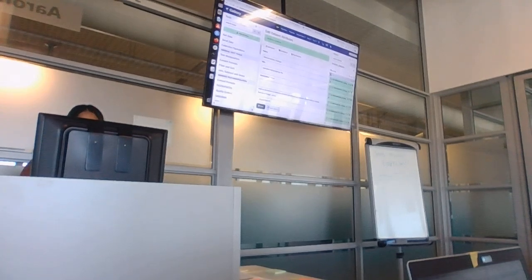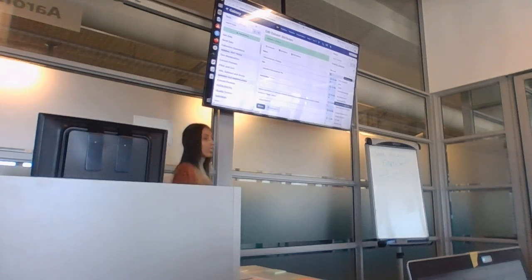So you're going to click on this. Click on select all. The icons are, like I said, ruined by the hackathon. You see this box is checked. Click on that to uncheck it and select all will appear. Click on select all and then click on the drop down by select all to click on build a list of dataset pairs.